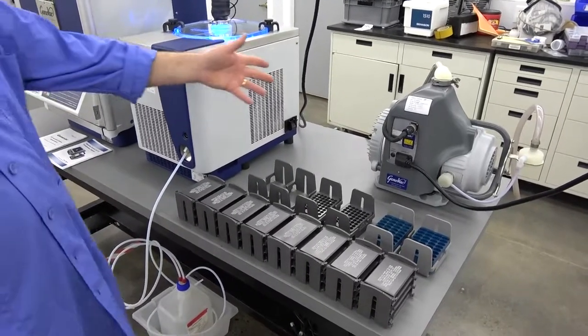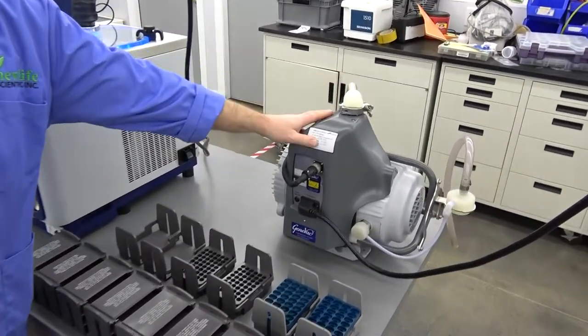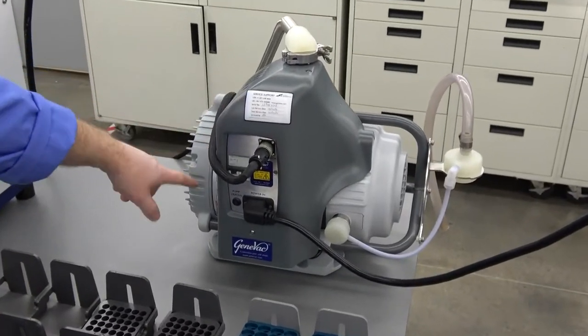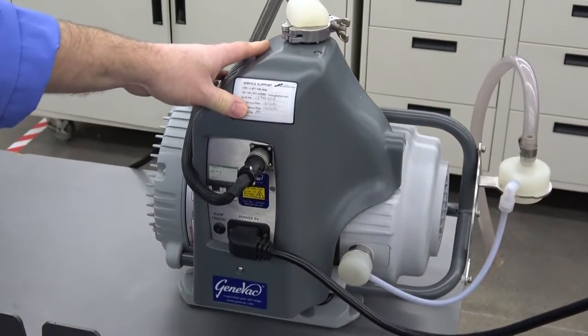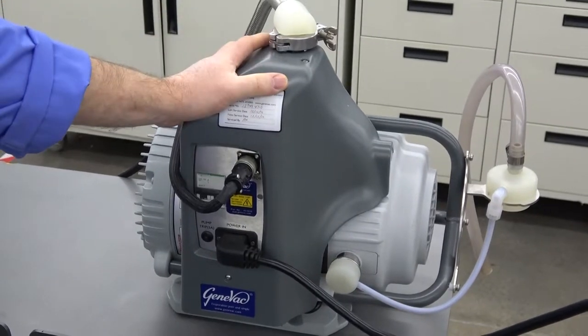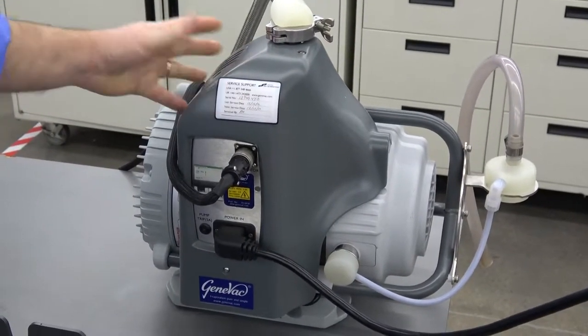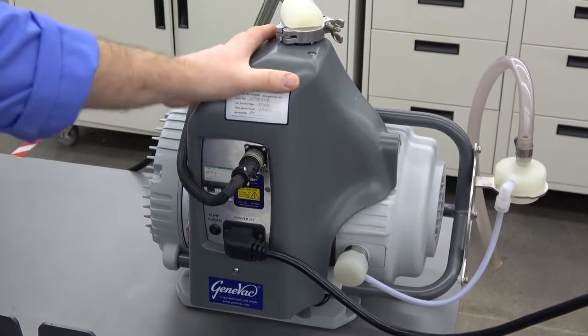And then also the GeneVac, and this is their upgraded vacuum pump. Of course, they're using the Edwards scroll where it's oilless. So you're not changing oils in this. It's running nice and quiet, as you can see.